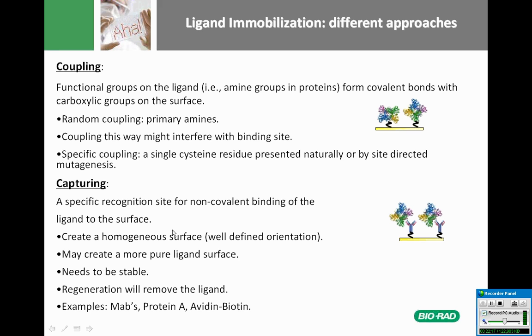It's not random. The surface will have ligands that are presented to the analyte in a homogeneous way. But one thing to take into account is that because it's a reversible binding event, your ligand might decay from the surface as it is not a covalent binding event.